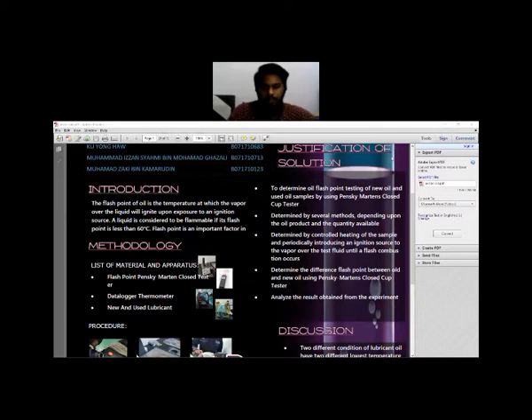It is not common for labs to employ flashpoint testing in applications outside of used oil analysis. However, depending on the machine application, the operating environment, potential of contamination, and testing conditions, a flashpoint test may provide the earliest indication of certain failure and root cause conditions.